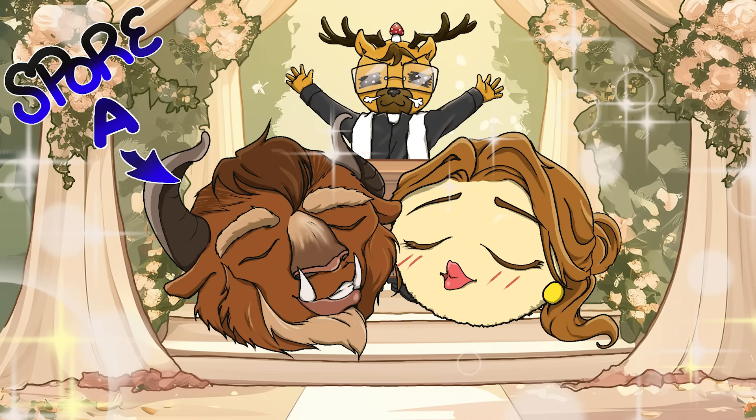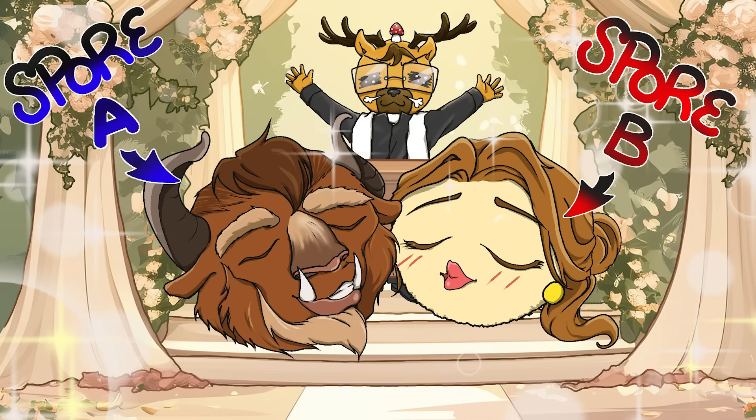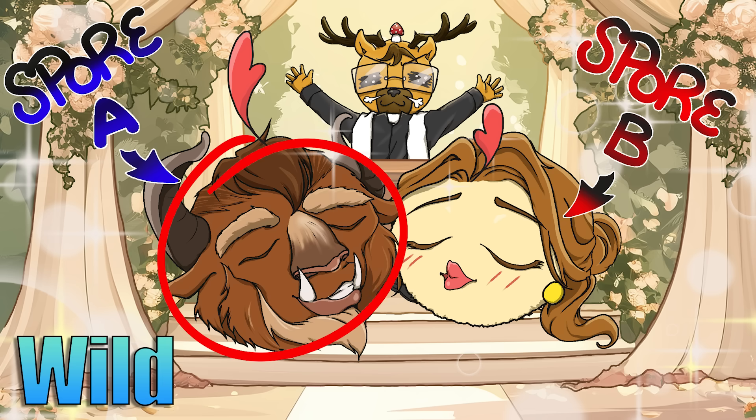Another popular method in the community is known as smash tech. This involves swabbing the gills of parent A and then swabbing the gills of parent B with the same swab, which essentially mixes and mingles both spores together on the swab. When you germinate it out on an agar plate, there's a good chance the spores have mated with each other.